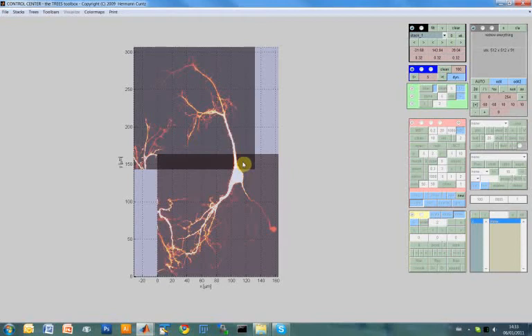Okay, I'm going now briefly through the automated reconstruction process. This yields good results only in particularly noise-free image stacks, and in any case the reconstructions have to be corrected manually afterwards.